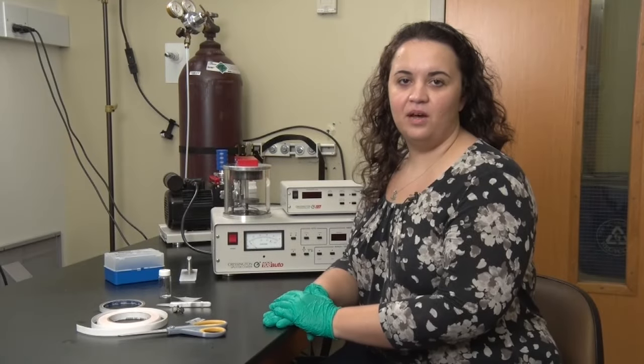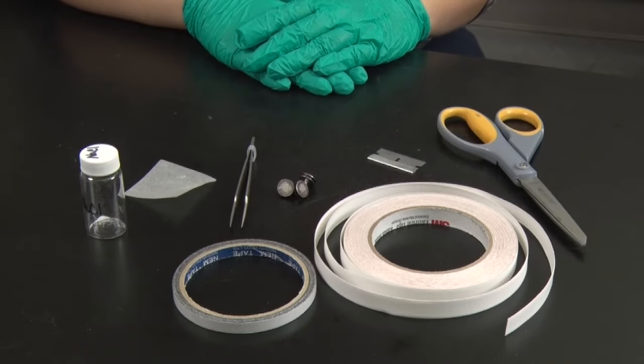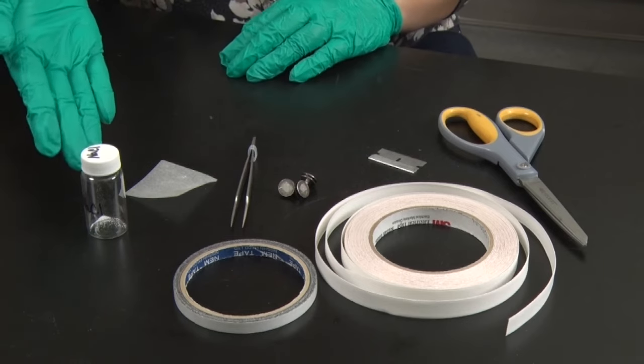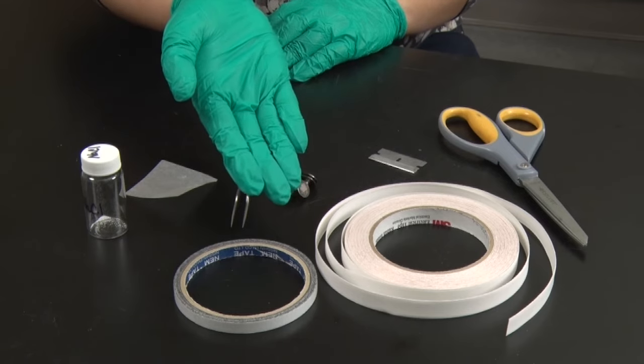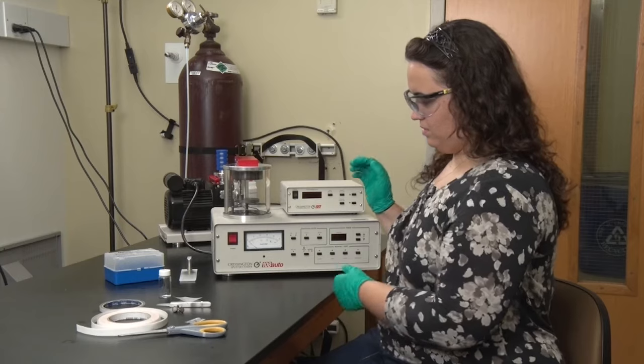Welcome to the SEM lab. Today, we will be imaging some salt crystals. The tools that we will need to prepare our sample for imaging today include the sample, tweezers, sample stubs, conductive tape, two common types are carbon tape and copper tape, and possibly a sputter coater.